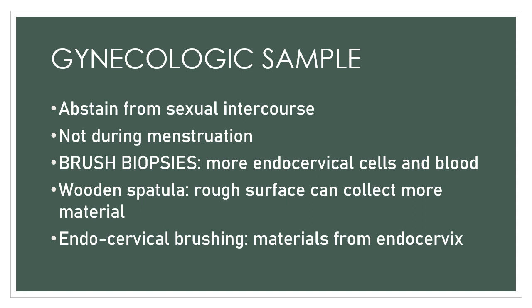Collection of your gynecologic sample should not be done during menstruation, because the bleeding and contamination with blood will obscure the cells during the smear exam. Instead of looking at the malignant cells, they are being obscured by your blood cells and other endometrial components.